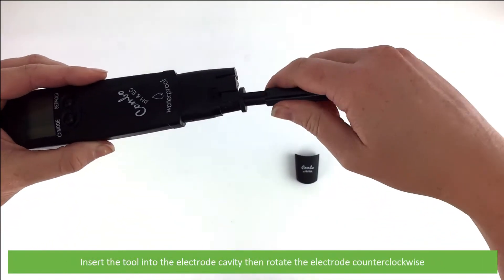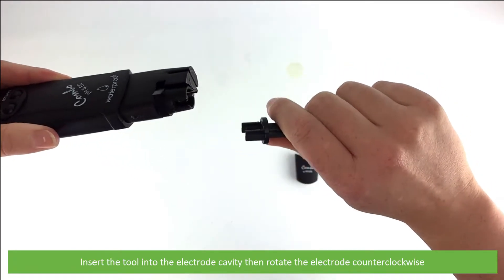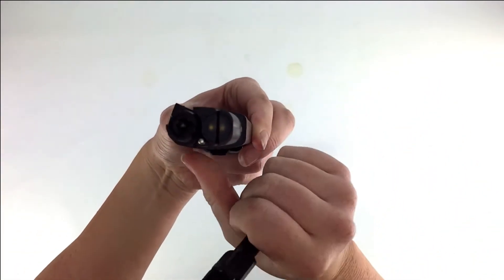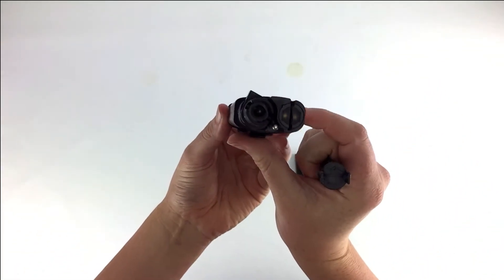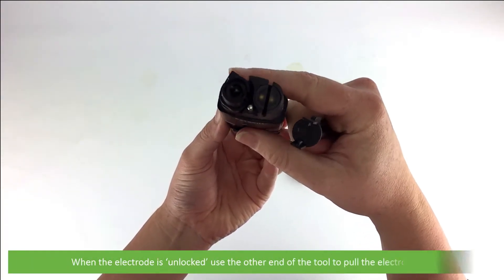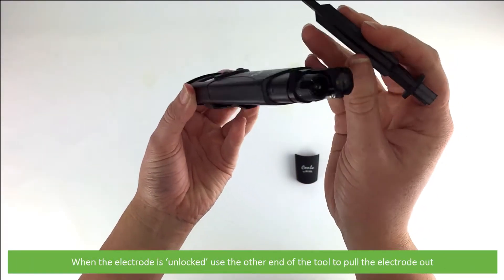Insert the tool into the electrode cavity then rotate the electrode counterclockwise. When the electrode is unlocked, use the other end of the tool to pull the electrode out.